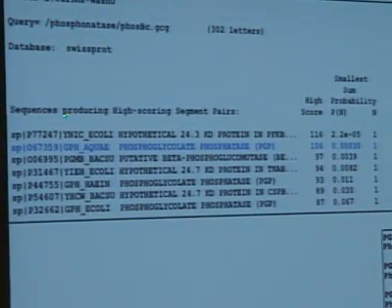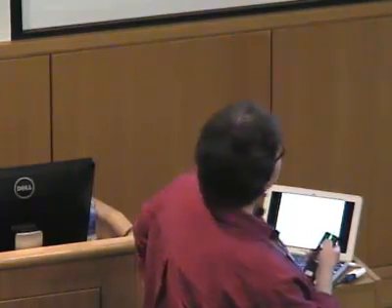Originally, we didn't know how this worked. This was work, again, with Debbie Mariano. We didn't know how this worked. And so we were looking for, this is a number of years ago, proteins that were similar, that we understood, so we'd get a better idea of how it worked. And so the first thing we did was run a BLAST, because there weren't very many tools at the time besides this. And this is actually from that experiment.